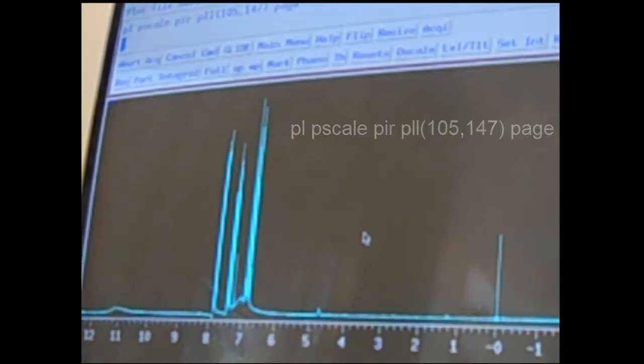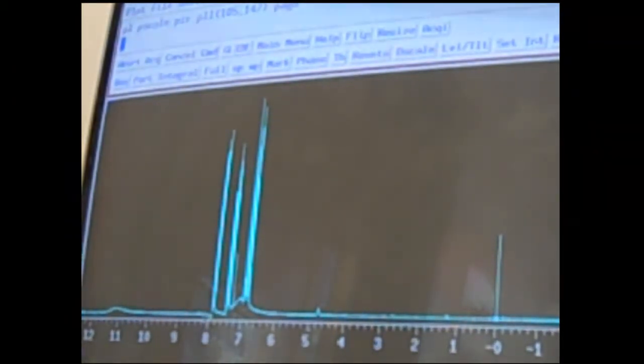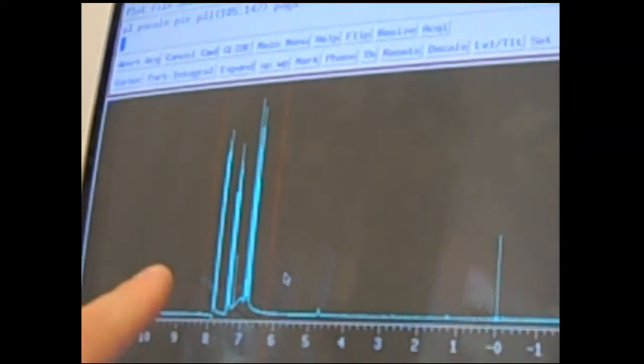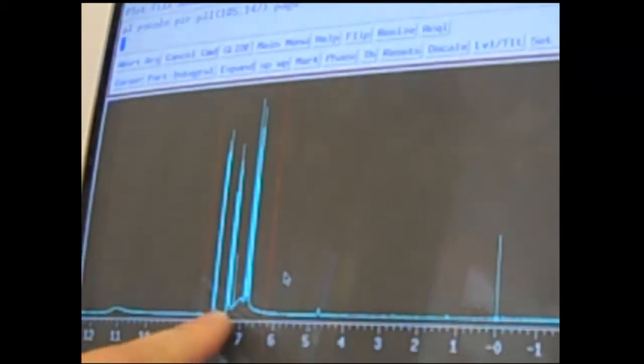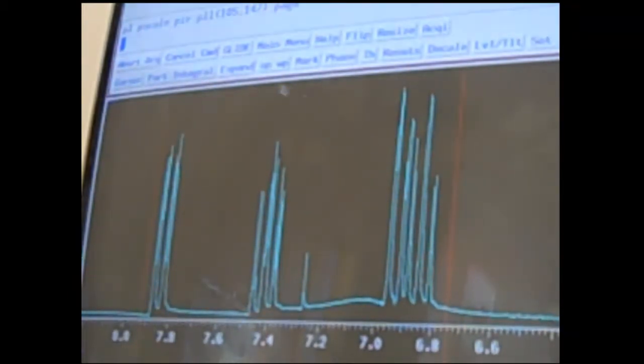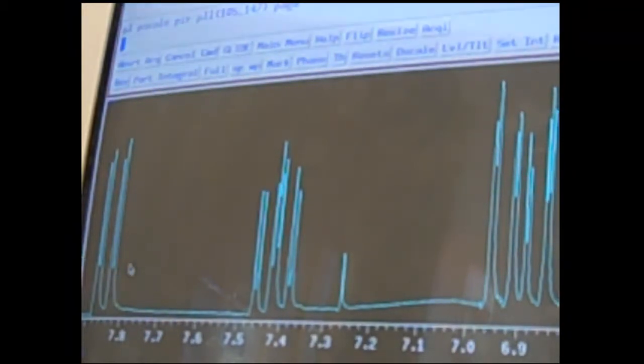Usually I like to print out a full spectrum and then also print out a spectrum specifically of the most important peak areas, like the aromatic peaks in this region. By expanding this out, students are able to see any complex splitting much more easily.